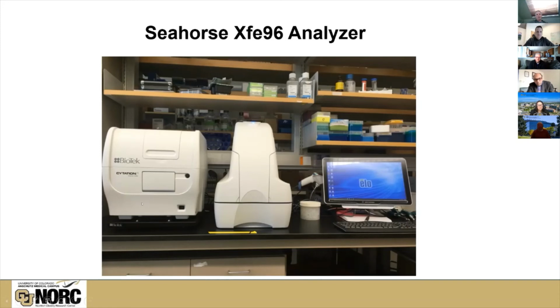Generally speaking, you put the Hoechst stain in last, but we actually had one user that put it in first. And our initial interpretation was that the data was going to be bad. It does not kill the stain. It does not kill the cells at all over the course of the experiments. So that's not a problem.